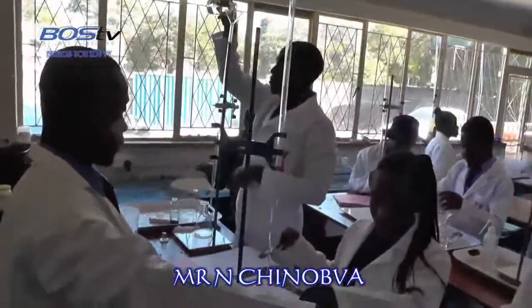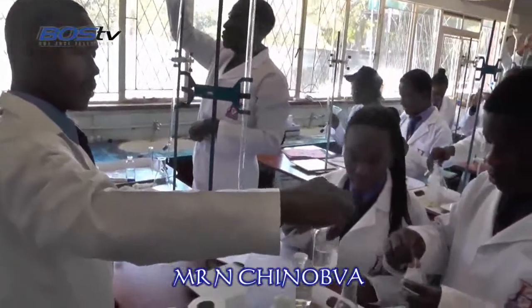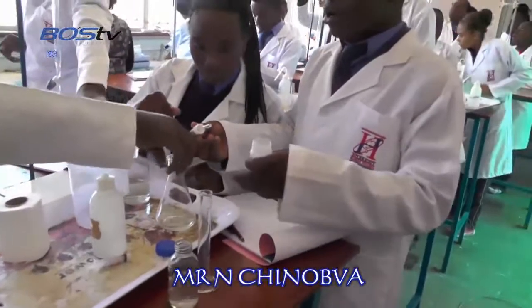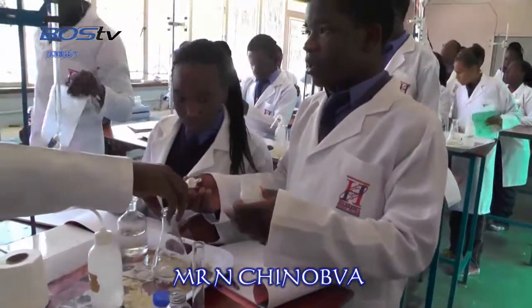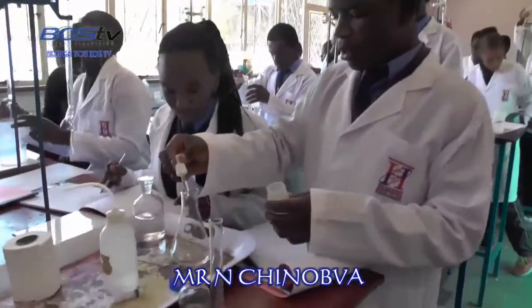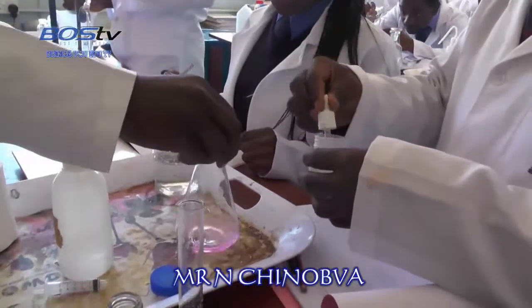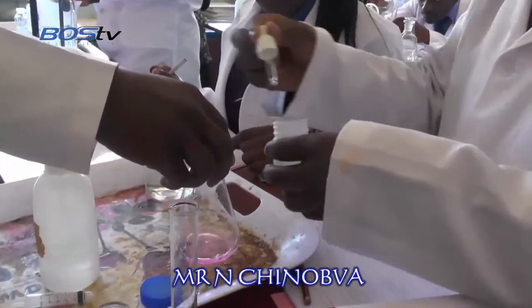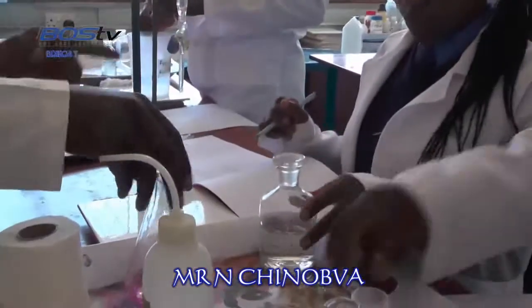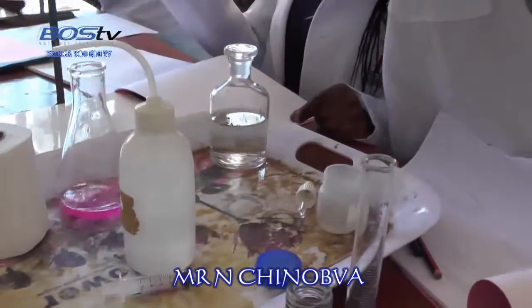Measure 25. What's that? It's R. And what's that? Phenolphthalein. Oh, you've already measured. Yes, it's also phenolphthalein, and a few more. And then pour your HCl into your burette before you begin the actual titration.